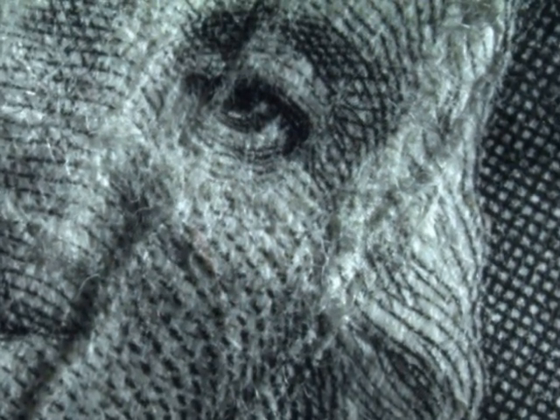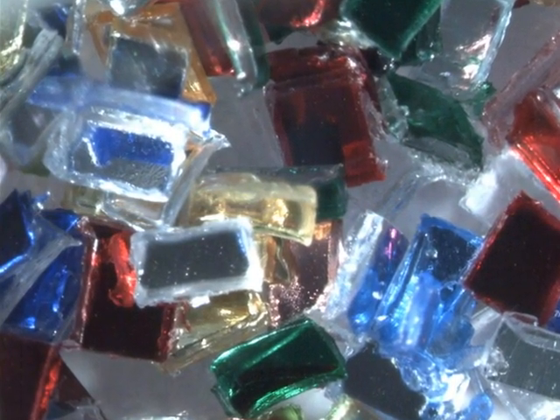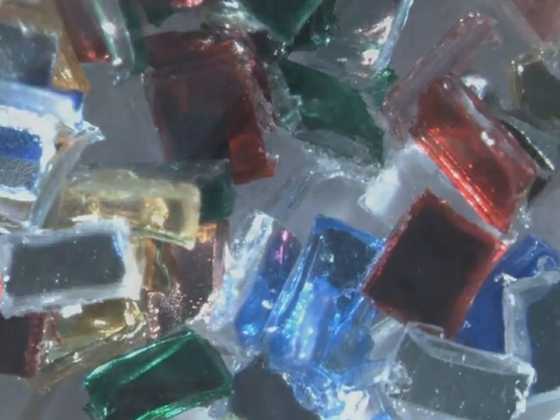In trace examination, the surface details are observed and used to help identify a sample using the stereomicroscope. Depending on the manufacturer, the sample possesses unique characteristics, and this can be beneficial to the analyst in the identification of a sample. For example, the layers of paint will differ depending on the manufacturer's procedure for making a paint sample. The layers that make up glitter can also be observed using stereomicroscopes.